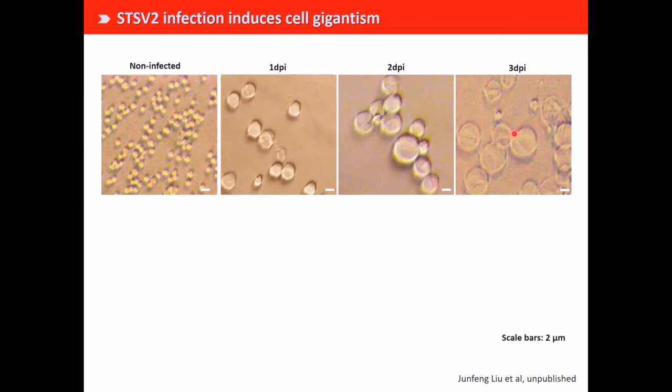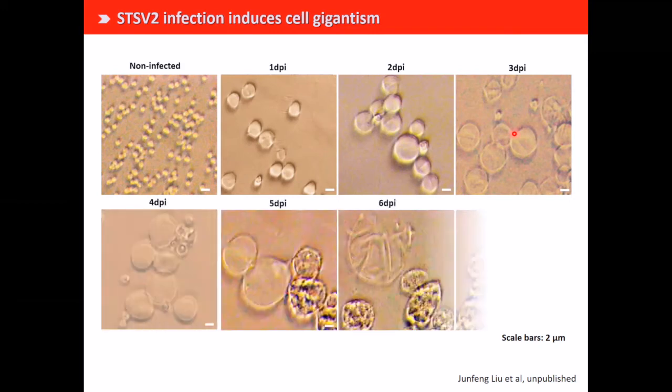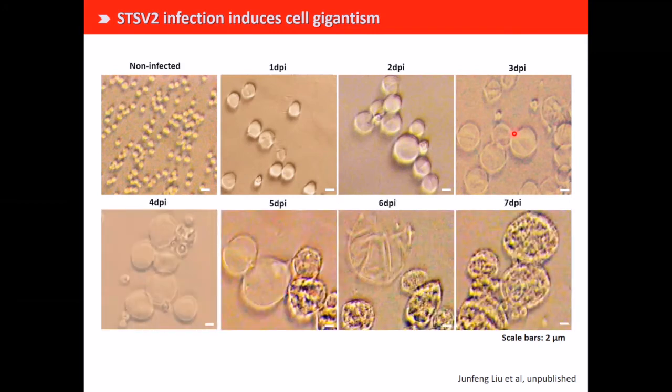And so we wondered what happens if you wait longer. Well, you wait longer, you get much bigger cells, right? So in a few days, we have observed up to 20 micron diameter cells, and this is huge compared to 1 micron. To get to 20 micron, which is around the size of many eukaryotic cells.